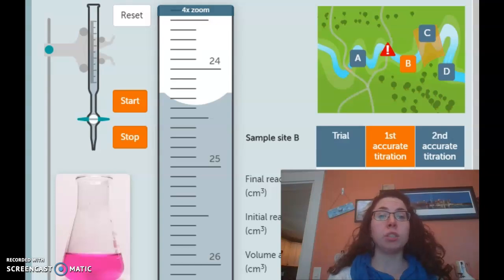Okay, the lab that you're going to be doing, a tanker that had acid in it was spilled into a stream, and that stream was contaminated. Scientists can use titration to figure out what is the concentration of the water that has now had acid mixed with it, to figure out, does something need to be done to fix that stream or to help the wildlife in that stream. It can also be used to figure out how much acid in your stomach an antacid like Tums can help to neutralize. How well does it work compared to a different brand?